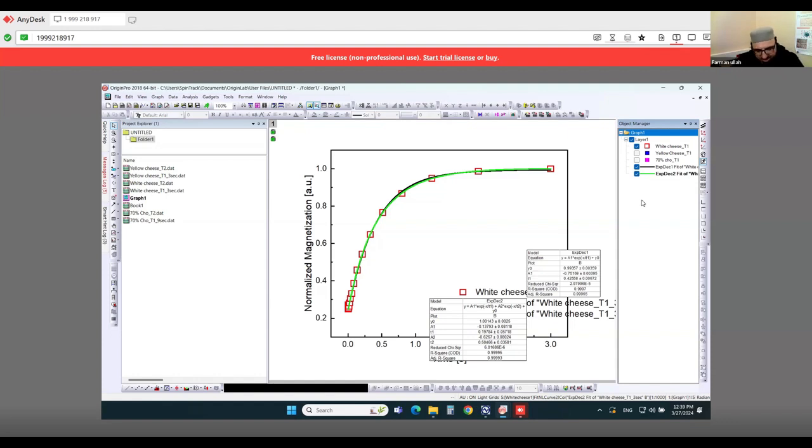The other simple way is to divide the slower component by the higher component. If the ratio between these two components is greater than ten percent, it will be biexponential, otherwise less. So this is some general concept.